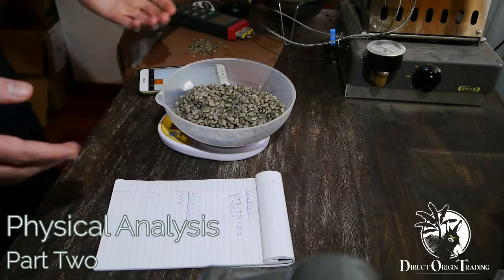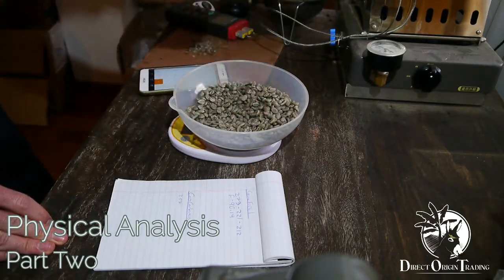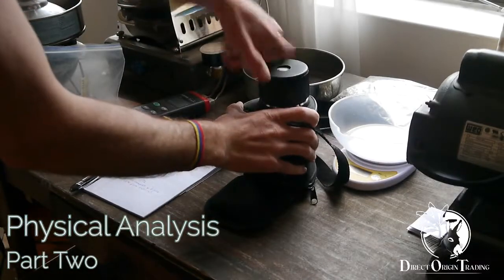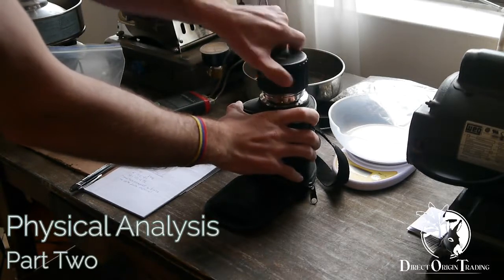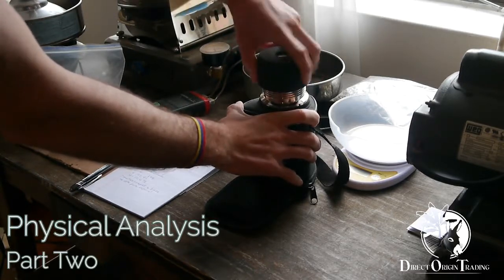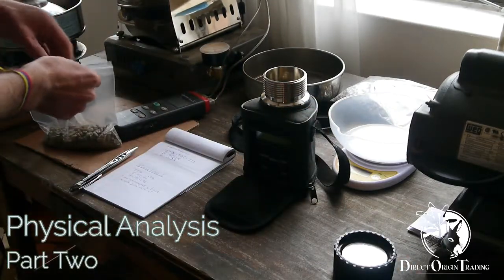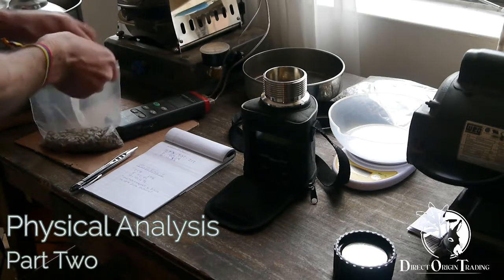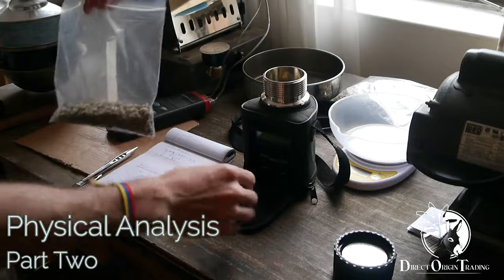Because what we're really interested in purchasing is not parchment, but the high quality green coffee that we can get out of it. Now the last step in our physical analysis process, we need to measure the moisture content. We have yield factor, but if the moisture content is high, sometimes that can inflate the yield factor a little bit. Yield factor again is basically how much healthy green coffee we can get from a certain amount of parchment coffee.